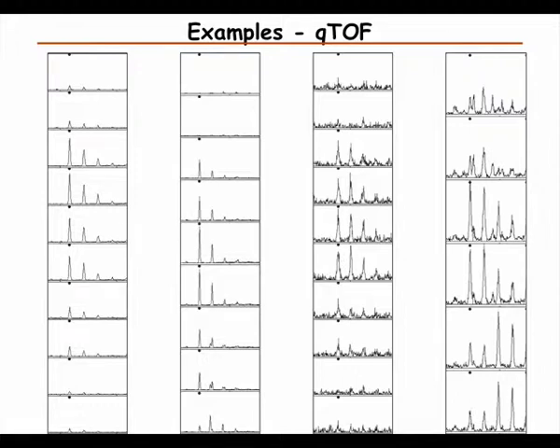And then another case where we really have a problem, and it's difficult to say what's exactly going on. There's definitely more than one peptide here, and here we really need to decide how to do the quantitation, or maybe this is a case where we just want to say that we can't use this for quantitation.